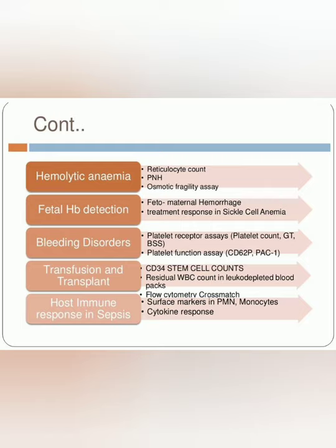Transfusion and transplant, CD34 stem cell count, residual WBC count in leukodepleted blood. Flow cytometry crossmatch, surface markers in PMN, monocyte cytokine responses.